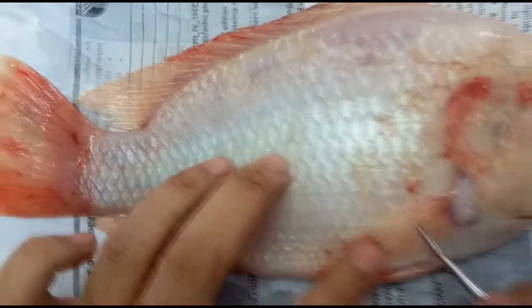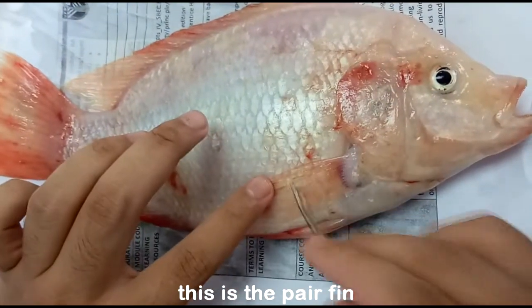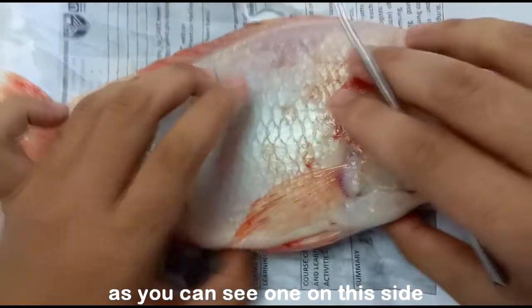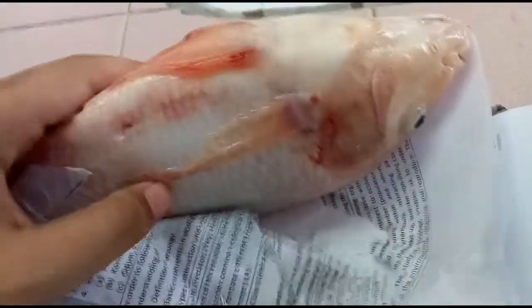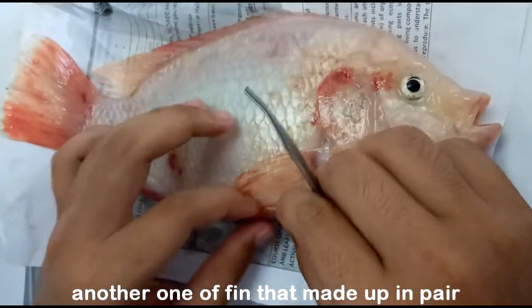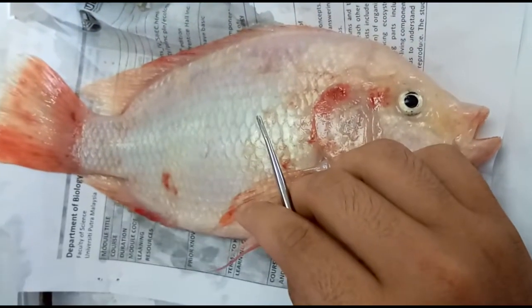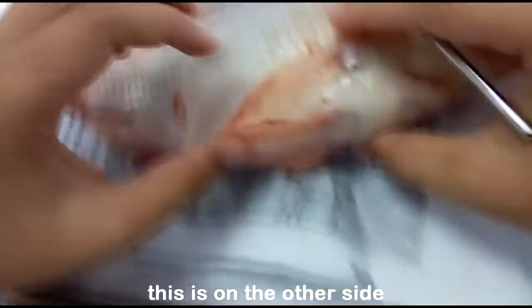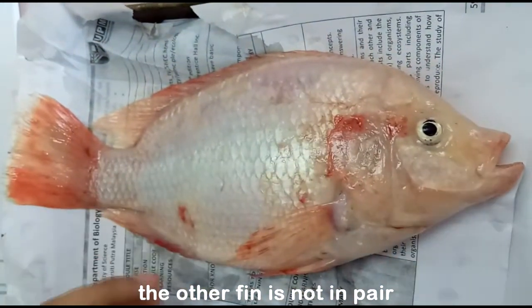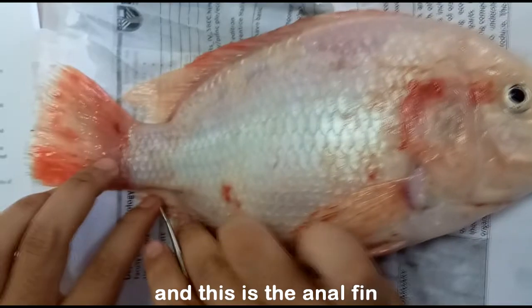Alright, now there are several fins, which are paired and unpaired ones. So this is the pair, which we know as the pectoral fins. As you can see, there is one on this side and another one on the other side. Alright, there is another fin that is paired, which is the pelvic fin. So this is the pelvic fin. This is on one side and this is on the other side. Alright, and the ones that are not paired are this, the dorsal fin, and this, the anal fin.